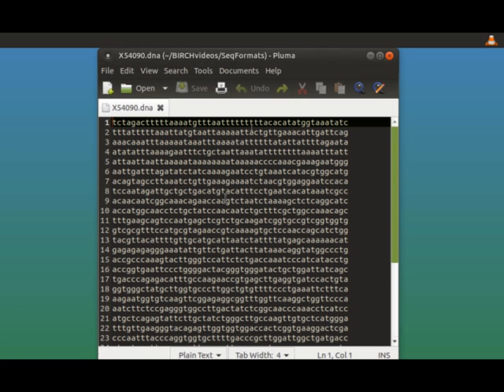Some of you may or may not know that a text editor is a lot like a word processor, but it only works with plain text, letters, numbers, any character that you can see on the screen. There's no such thing as fonts or boldface or underlining or pagination. It's just plain raw text. So most data for scientific work actually is in text files of this type, and so you read these files with a text editor. On Windows, you might think about, for example, the Notepad editor as an example of a text editor.